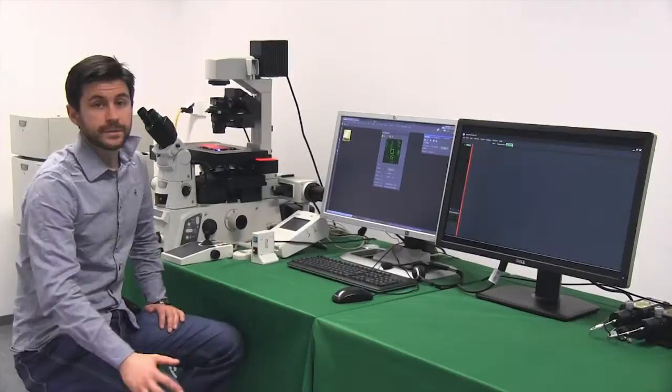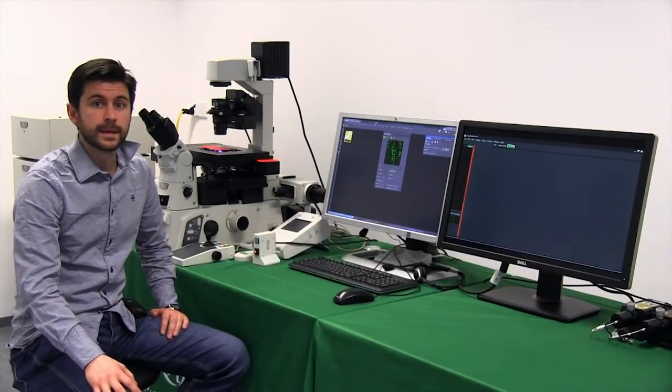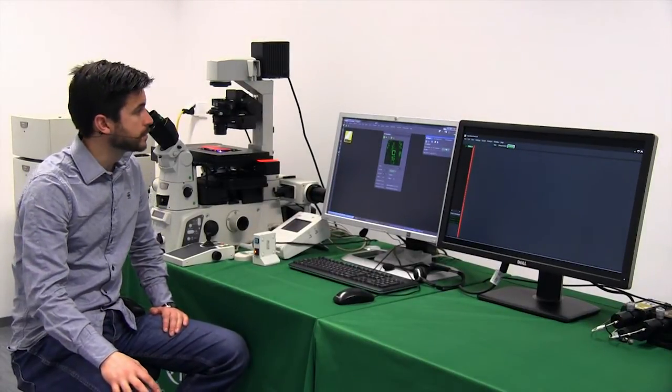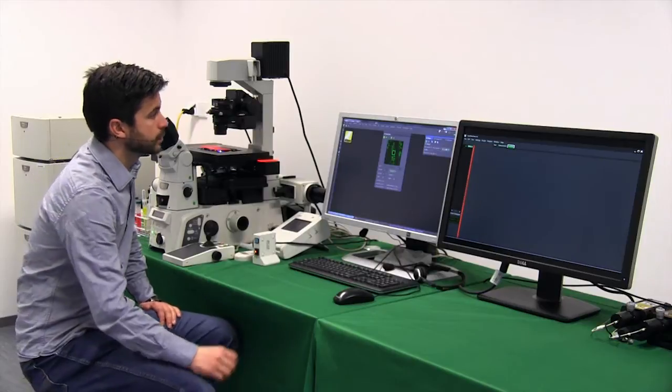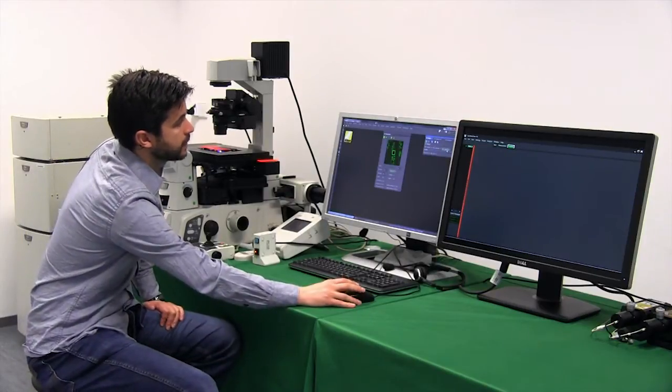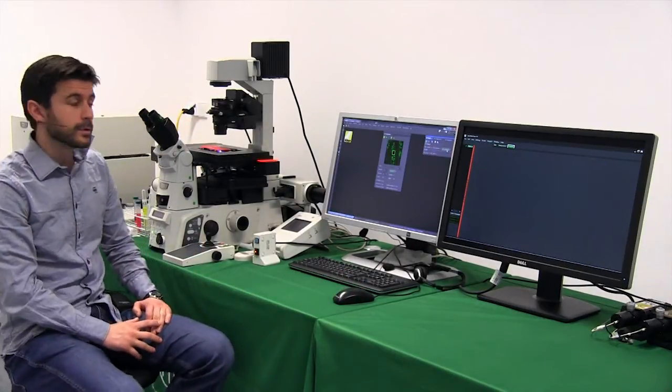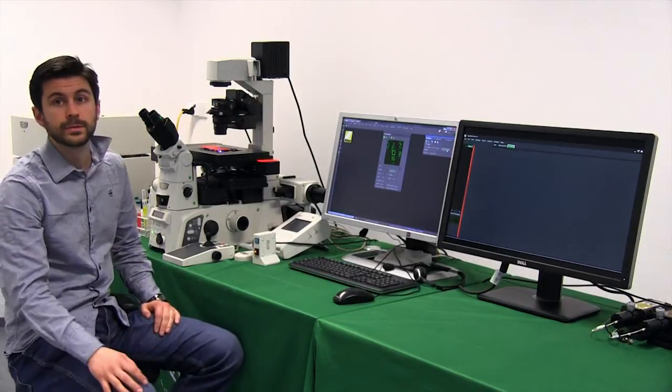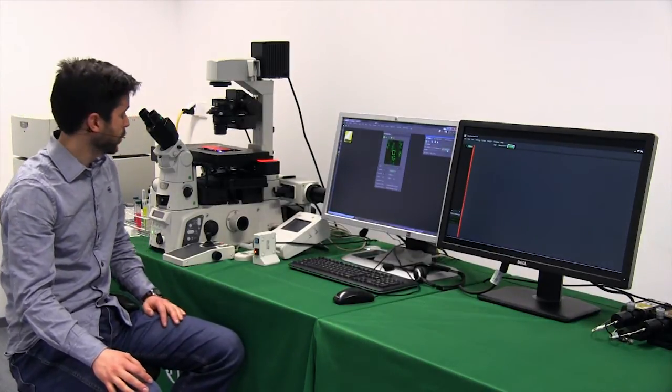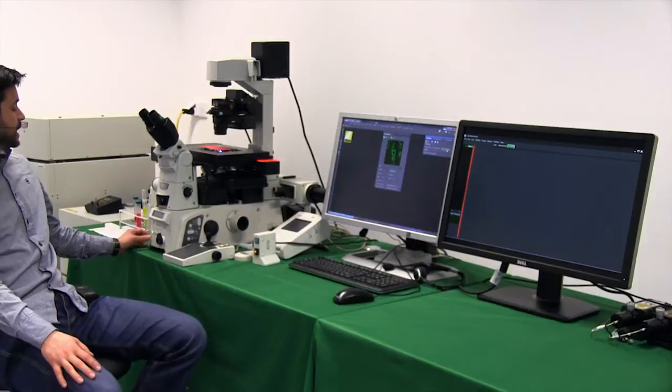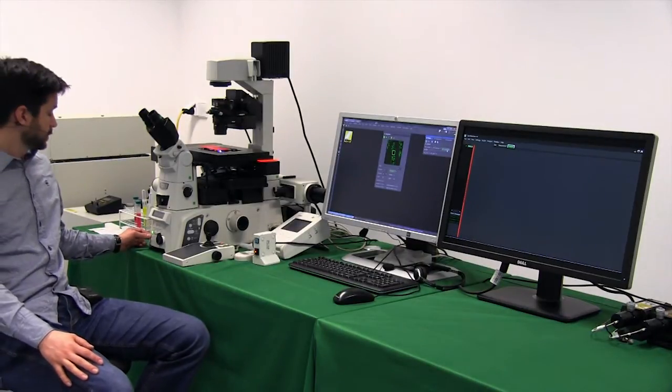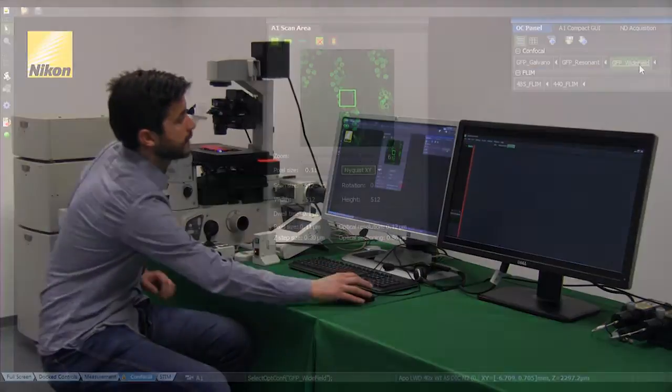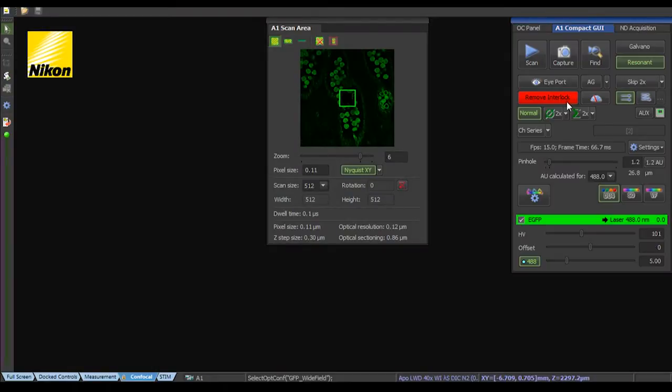Of course the first thing to do is to locate our sample with the Nikon microscope. This we could do in wide field so the sample is already in focus. If we want to change to confocal, we have to change here to the side port manually and then release the interlock.